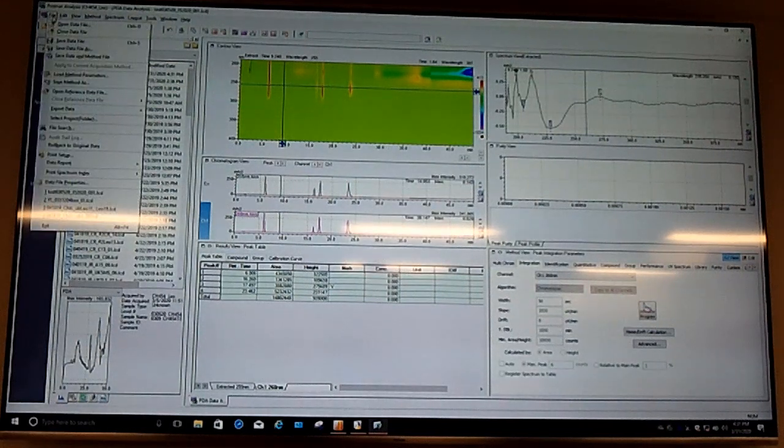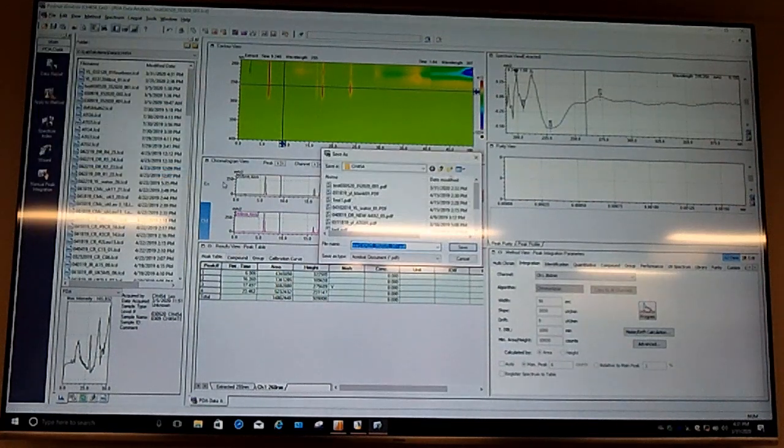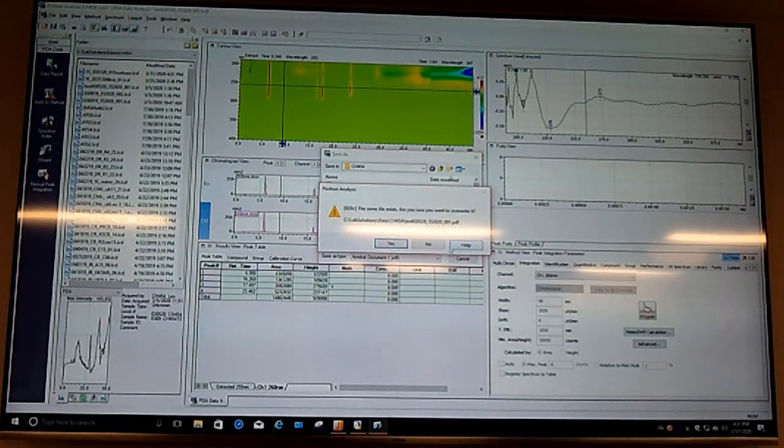And if you want very nice figures for your lab report or whatever, you can go here, then print spectral index, data report, and then report as a PDF output. This will save your chromatograph as PDF and will include both the HPLC trace and also the table. So let's try it, save it.